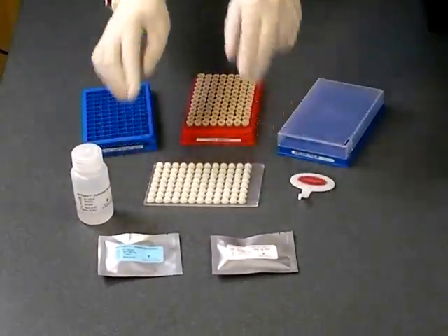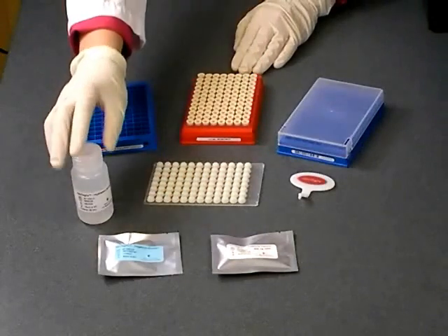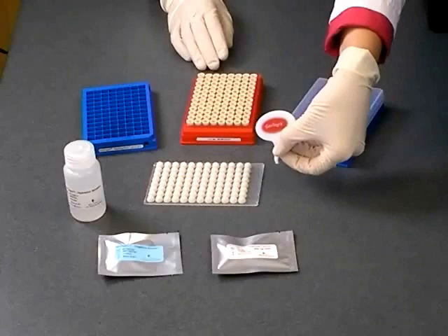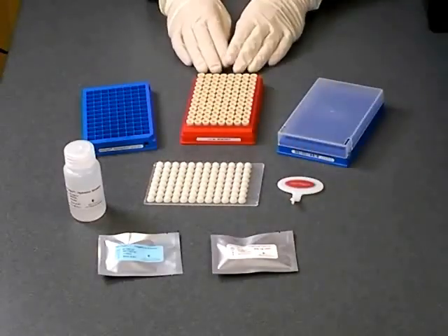The kit also includes cap mats, hydration solution, a decapper, and both positive and negative controls.